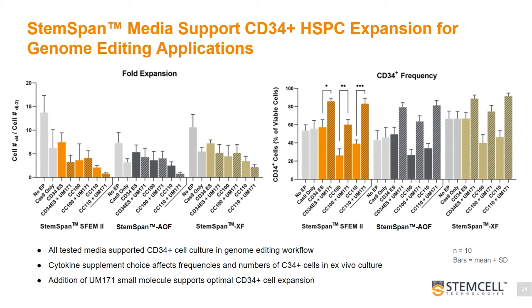Maintenance of CD34 cell frequencies was further improved by addition of UM171 molecule, depicted by the striped bars on the right plot, irrespective of cytokine supplement, and resulted in optimal CD34 cell numbers and frequencies. Similar trends were observed across other tested media, StemSpan AOF and StemSpan XF.